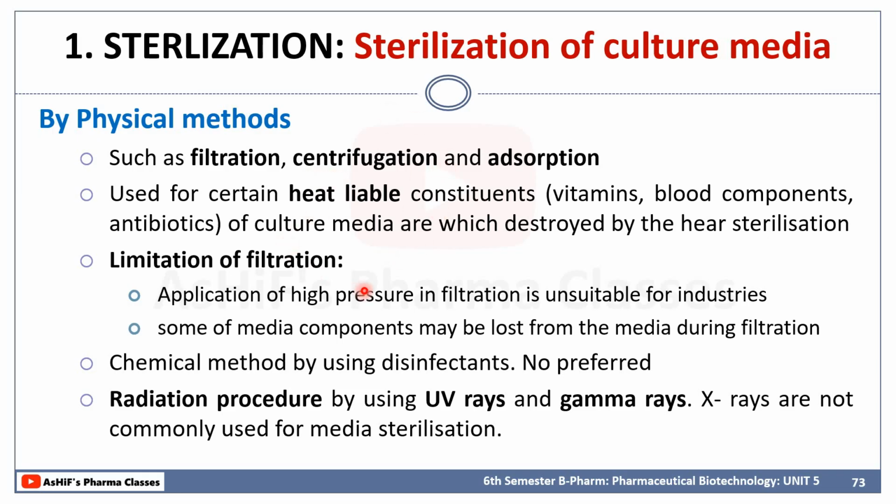But there are some limitations for filtration. We cannot give high pressure in filtration, because sometimes we may have to increase the speed of the process, and in order to increase the speed, we may have to give pressure. So it is not possible in case of the filtration process, and some of the media components may be lost during filtration. So that is also not a good thing for sterilization of the culture media.